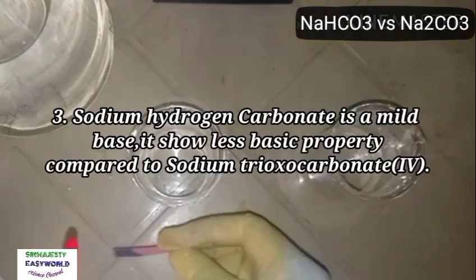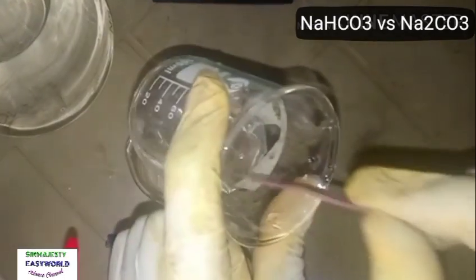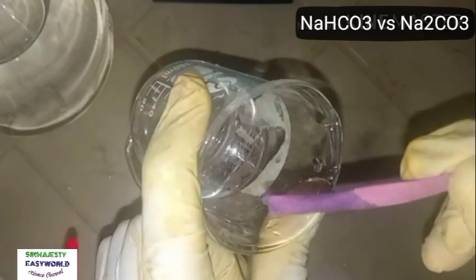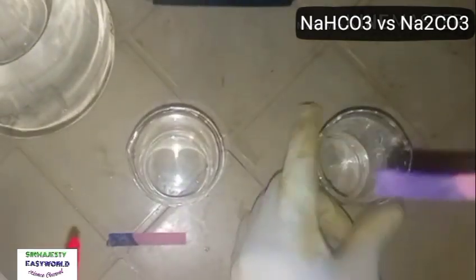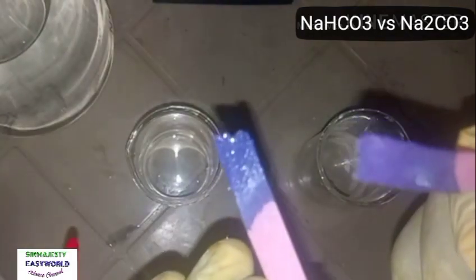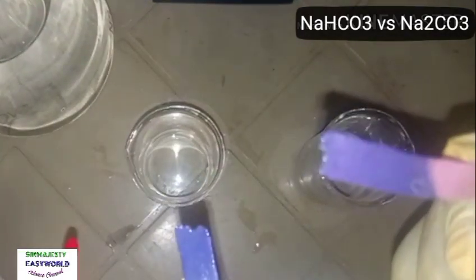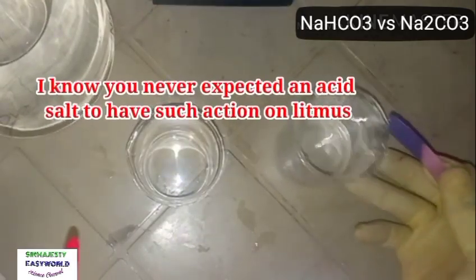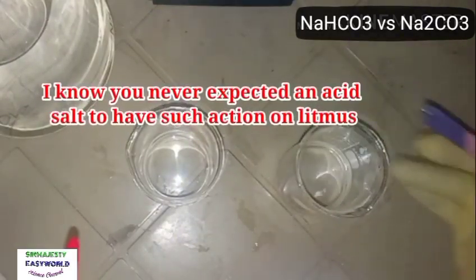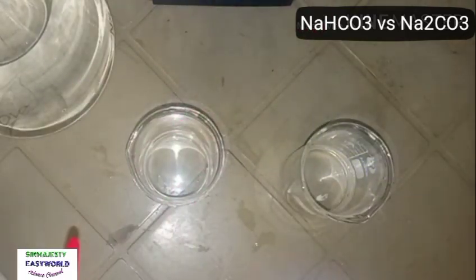So let's see what happens if we put it on this bicarbonate, that's sodium hydrogen carbonate. You see, it's partial, it's not changing it immediately. It's very slow, though it's turning it blue, but very slow. This is pure blue. This is slow again. That might not conform with what you know. Being an acid salt, why will it even have effect on this? That's another discussion for another day.